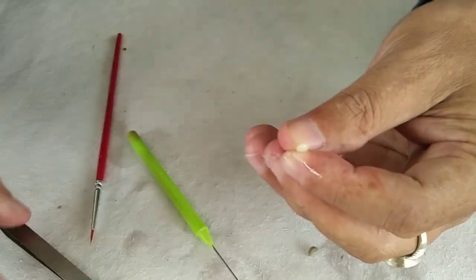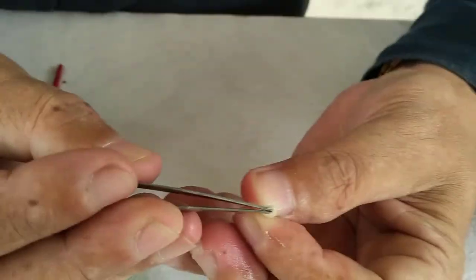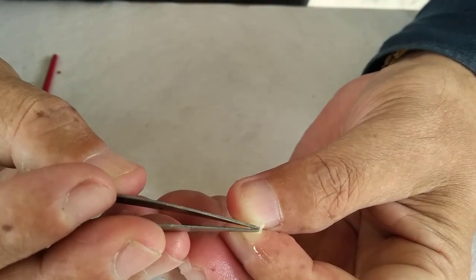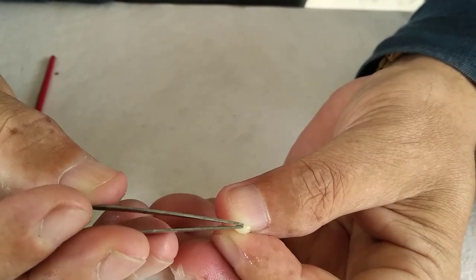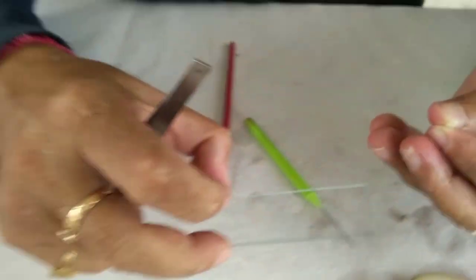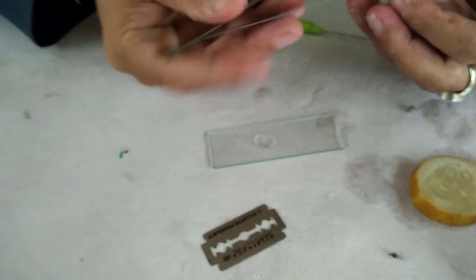You have to cut from the top — just split open, just give it a small slit. When you give that slit, automatically — look at this — you can see I have separated the seed into two pieces. Then what do you do: you take a glass slide, put a drop of water, and you take the seed.